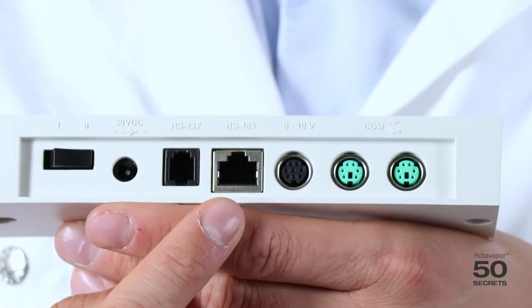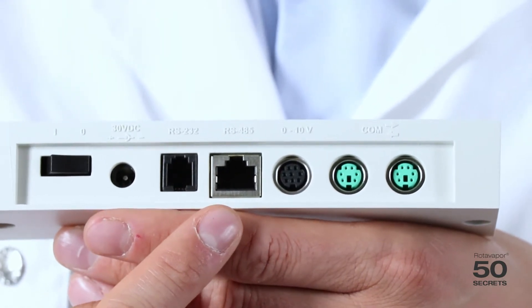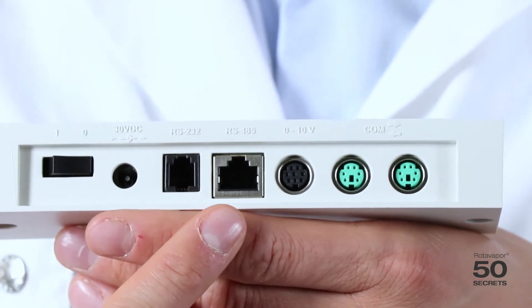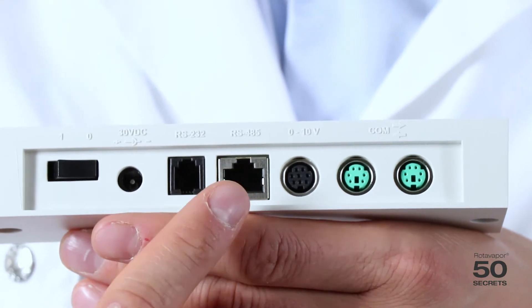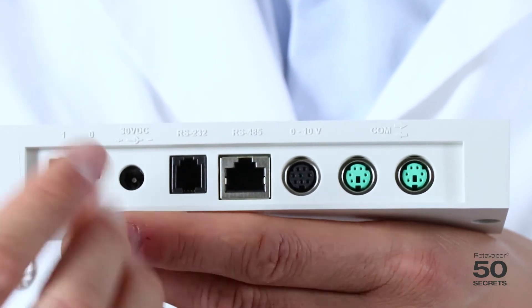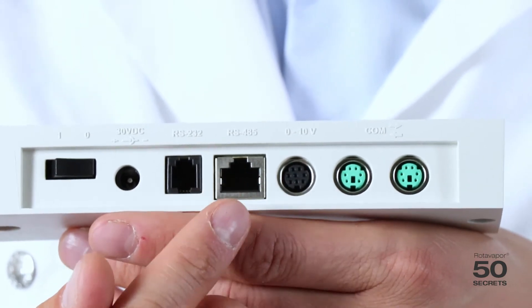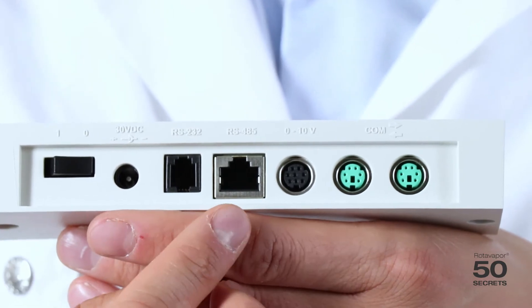The RS485 was the standard port of our previous instruments such as the R210, R215, V700, V710, etc. You only need to connect one of these instruments — for example from the R210 to the V700. That is typically used if you have a new interface and want to control an old rotary evaporator.